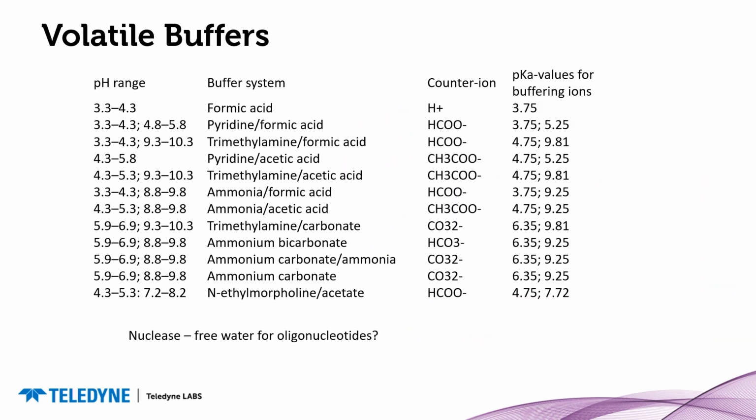Here is a list of volatile buffers which can be used to purify peptides and oligonucleotides. One thing to note is that for some samples you might need to use nuclease-free water. You probably want to use DNase or RNase ZAP to help keep your oligos from degrading.